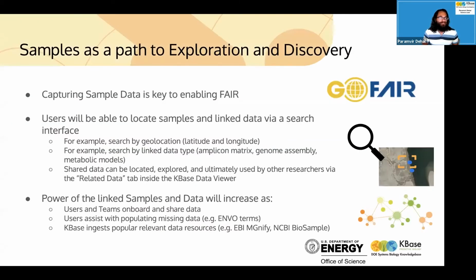So we go to the next slide. Samples serve as a path for exploration and discovery of data in KBase. Capturing sample data is one of the key things to enable FAIR data representation: findable, accessible, interoperable, and reusable. So when you share data, everyone will know what sample it came from and what the sample properties were.